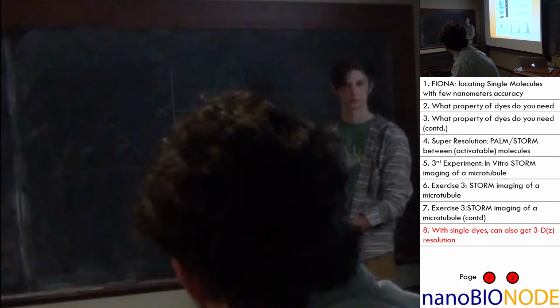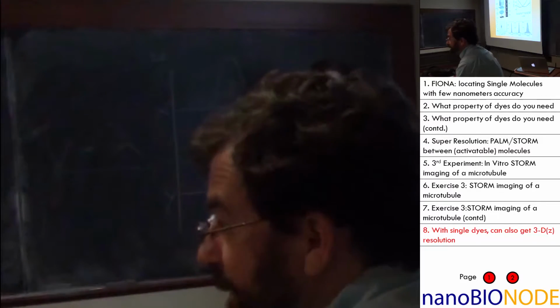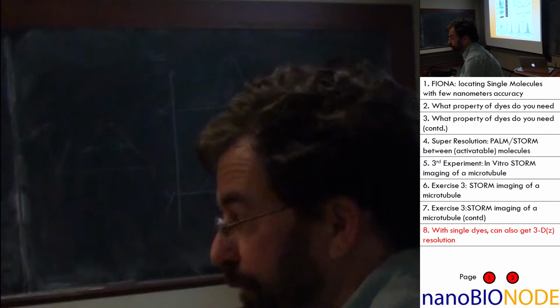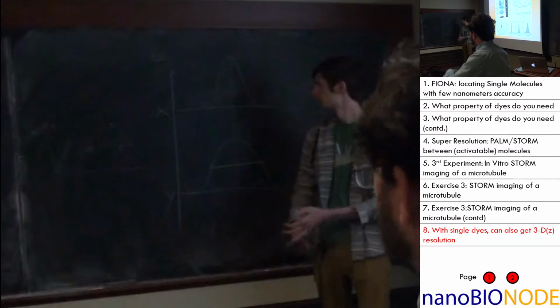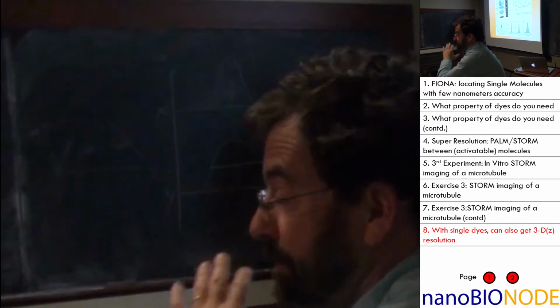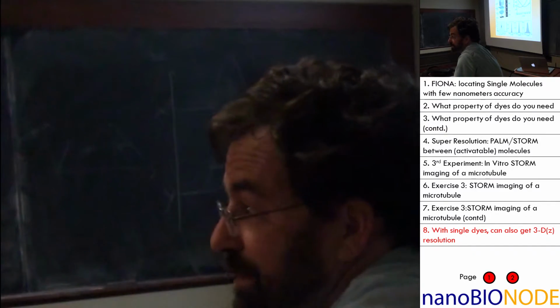Much larger than it initially was. Its width is larger, so the width over root n is a larger fraction. That's right. It looks like, roughly in that minus 400 nanometer range, it's roughly 2 or 3 times the width. So instead of 250, it's 500 or 750 divided by the square root of n. And that's right, so you have actually lost a little something.